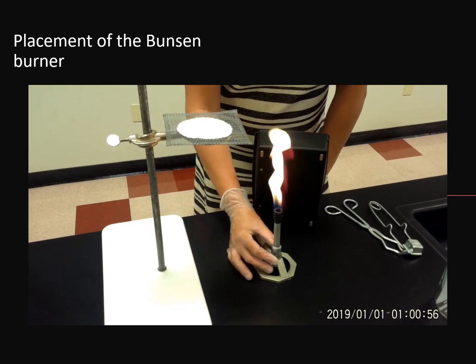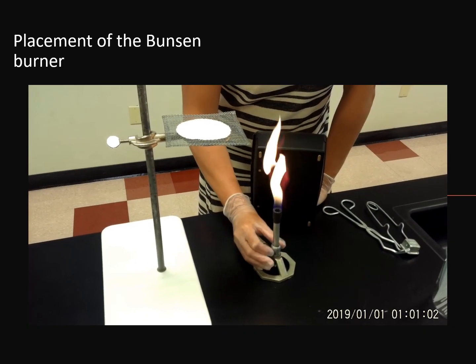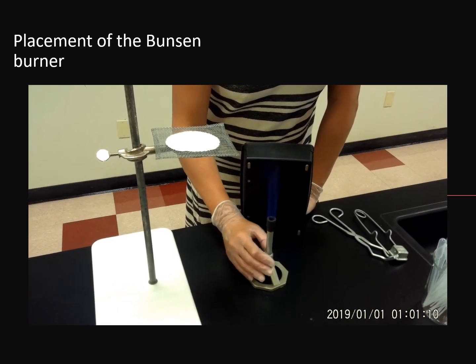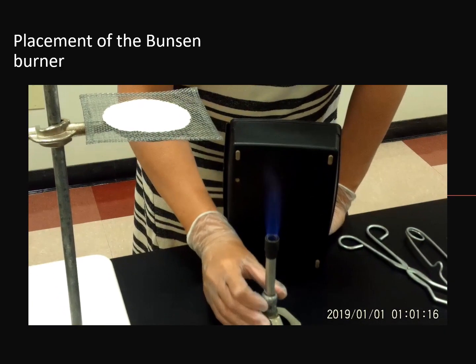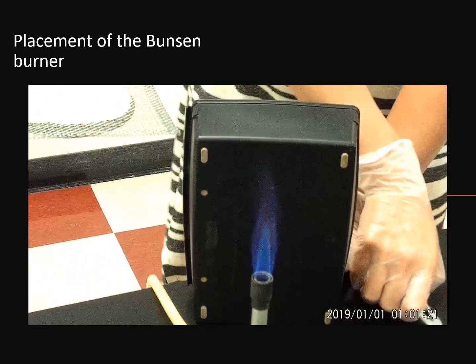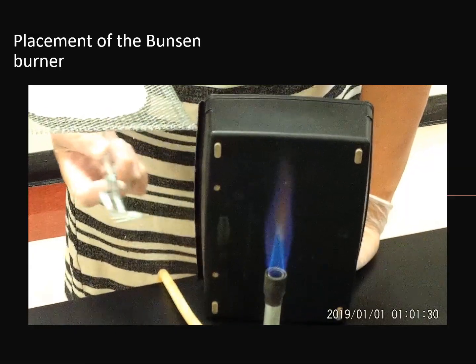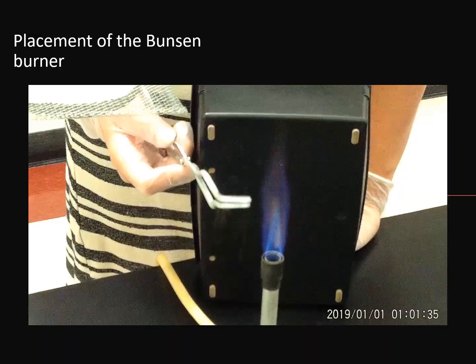When you have your air vent completely closed, you have a cool, luminous flame. It's like a candle. And what you do is you carefully open up the air vent so you get a good mixture of gas and air in here. As you increase the oxygen content from the air, you get to the point where you have a really nice hot flame. The inside light blue at the very tip of that flame is the hottest part of your Bunsen burner flame, and that will be sufficient to melt copper and burn it.